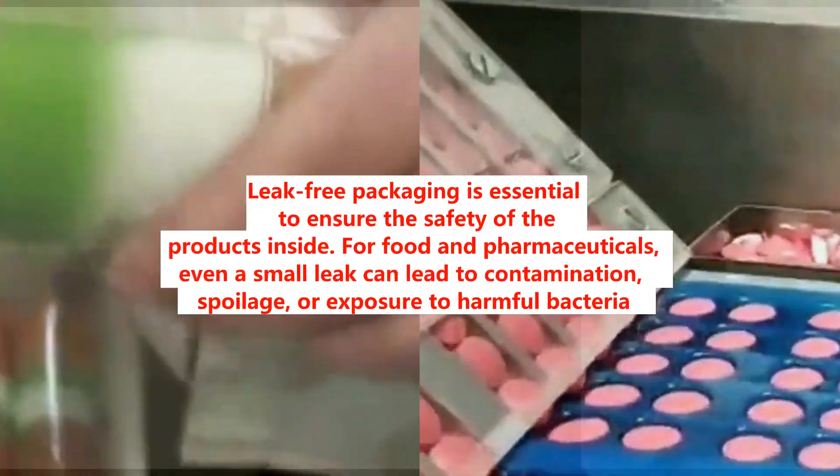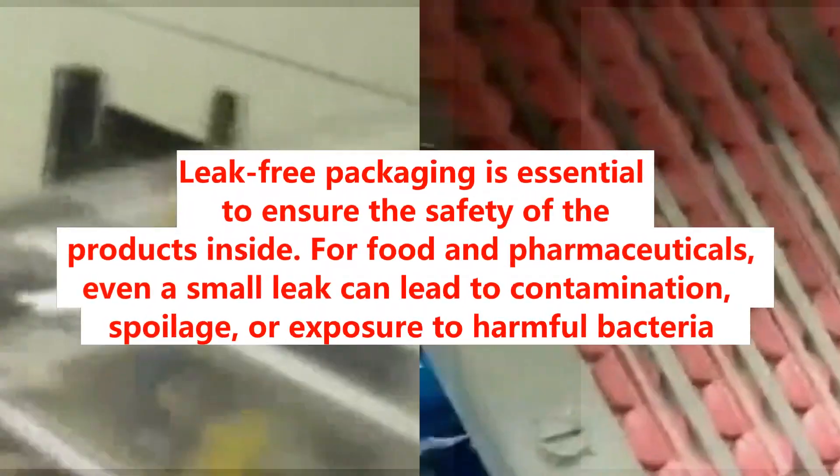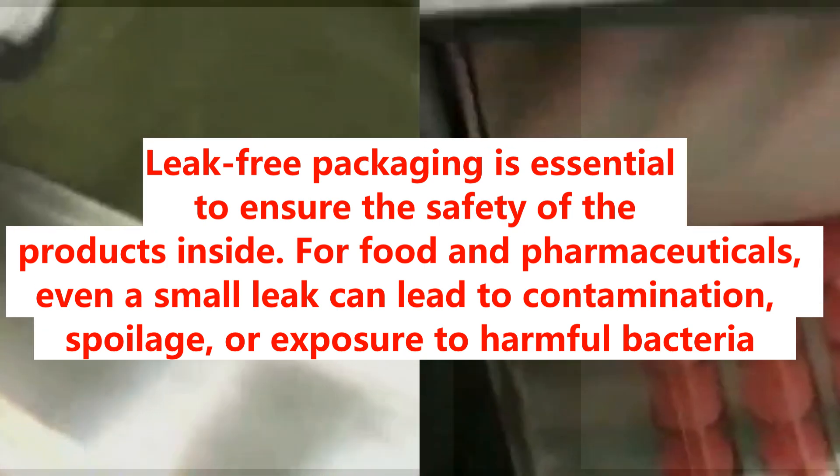Leak-free packaging is essential to ensure the safety of the products inside. For food and pharmaceuticals, even a small leak can lead to contamination, spoilage, or exposure to harmful bacteria.